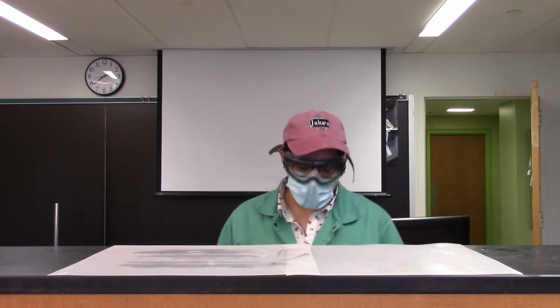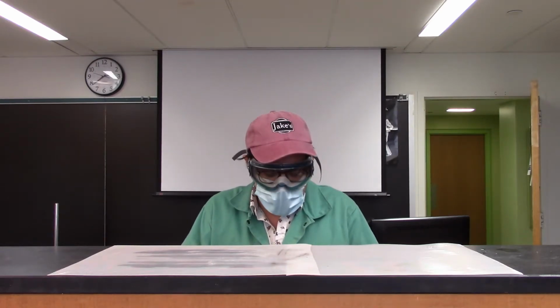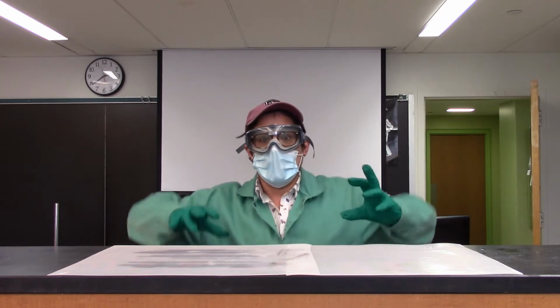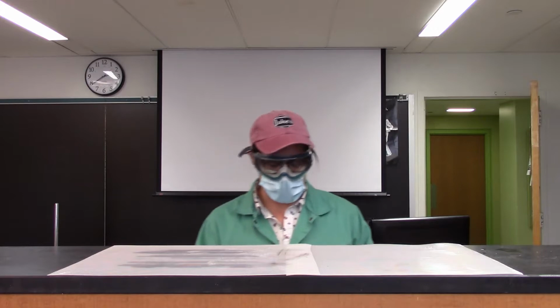Hi everyone, welcome to the investigation of the stoichiometry of the reaction of a metal and hydrochloric acid. First thing I'm going to do is go over with you how to create the water reservoir, which is going to be the main function of this lab. This is how we are going to get a crucial piece of our data to use the ideal gas law to calculate our stoichiometries here.